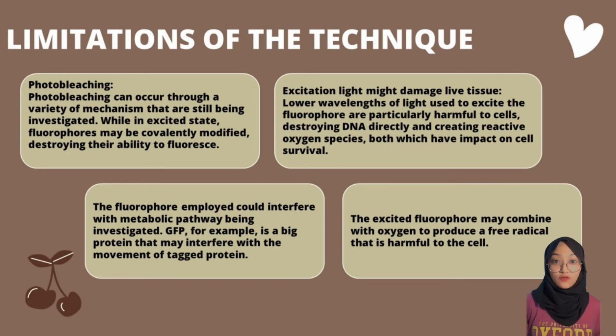Actually, fluorophores or fluorochromes are fluorescent chemical compounds that are capable of absorbing light from a laser and re-emitting the light within a range of wavelengths upon excitation.